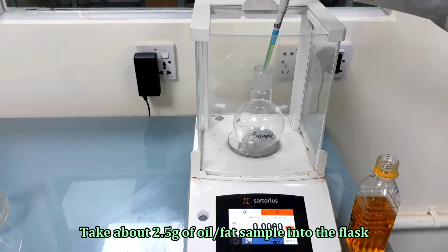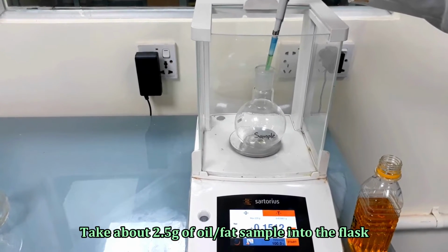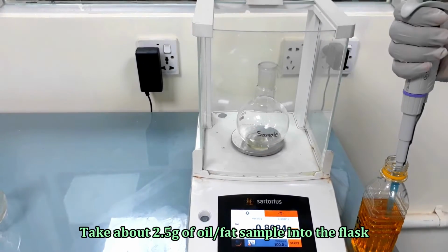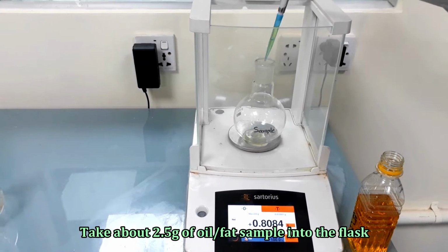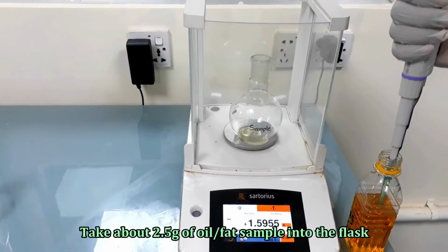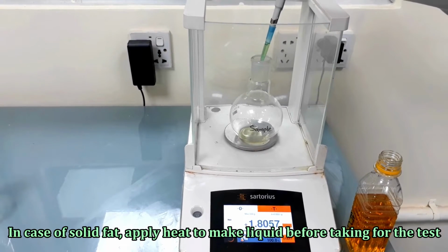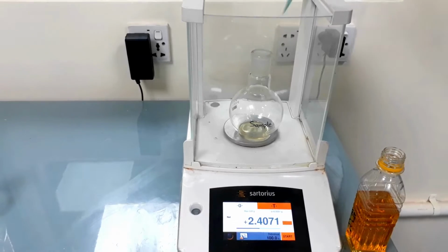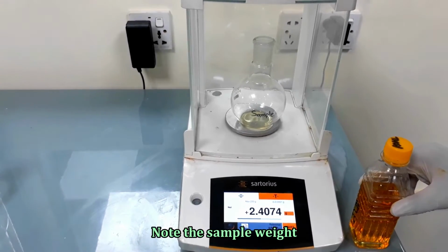Take about 2.5 grams of oil or fat sample in a saponification flask. Note the sample weight.